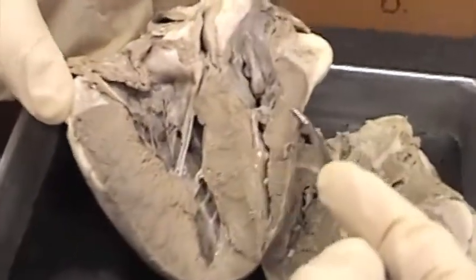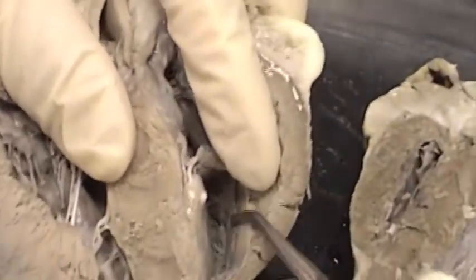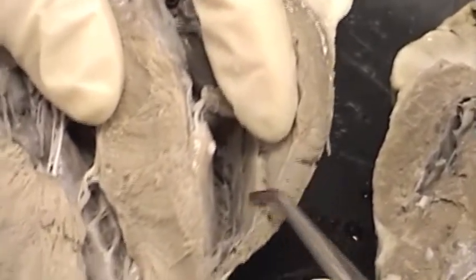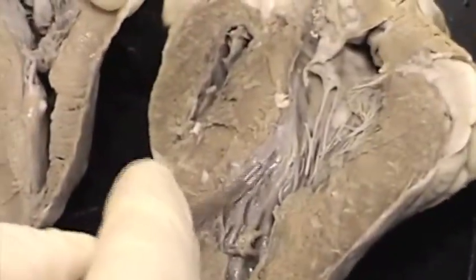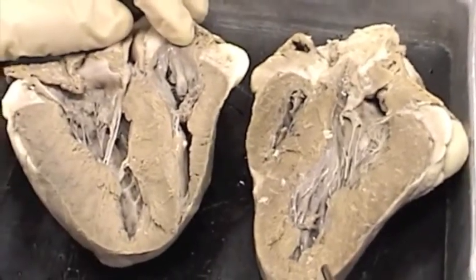The muscle layer here is the myocardium. And then lining the heart is a thin layer of epithelium called the endocardium. You can see some shiny stuff right there — that's the endocardium. It is continuous into the blood vessels with the endothelium.